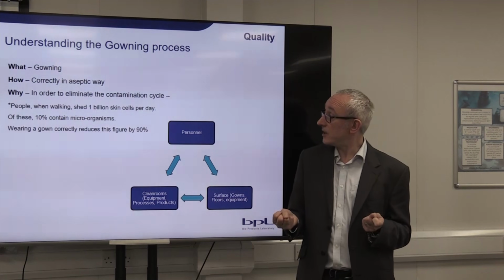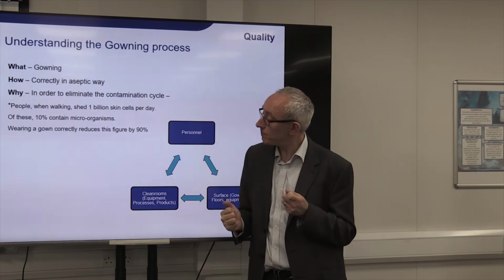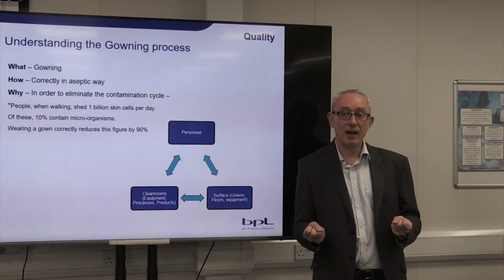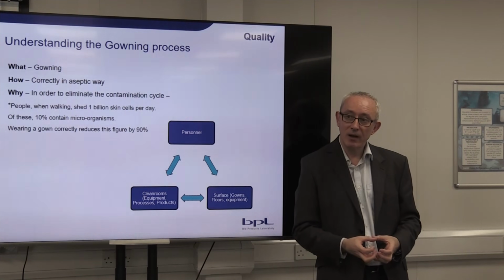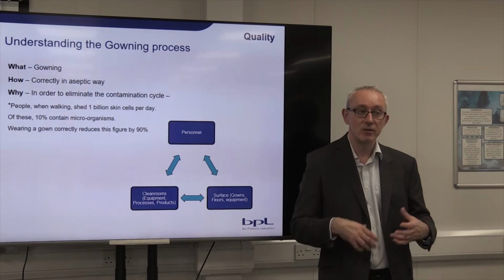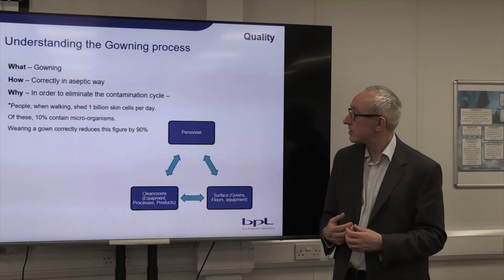So there's a lot of key aspects to getting gowned in an aseptic way. It includes things like the suit is not allowed to touch the floor, which means that as you're getting gowned, you undo your suit, which is wrapped in a particular way, and you need to do it in such a way that you're putting your legs up and sliding the suit on and so on. So keep on practicing gowning is the best advice.